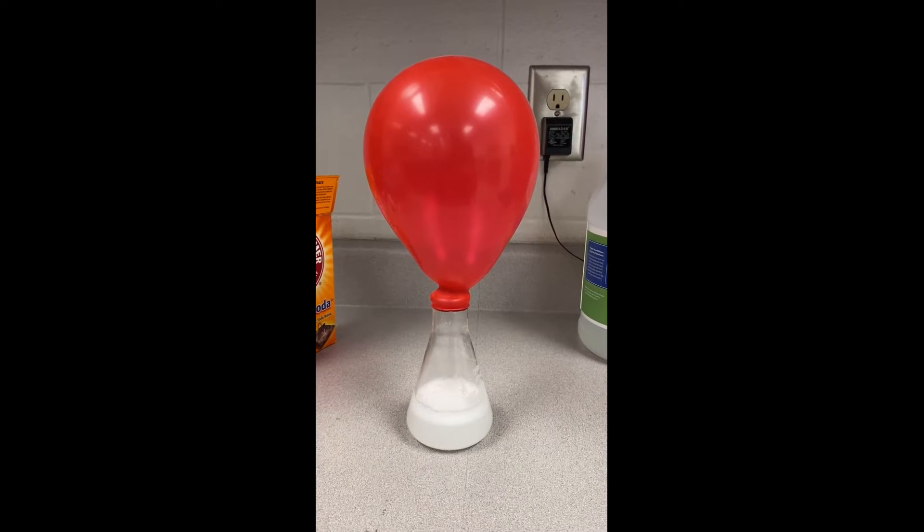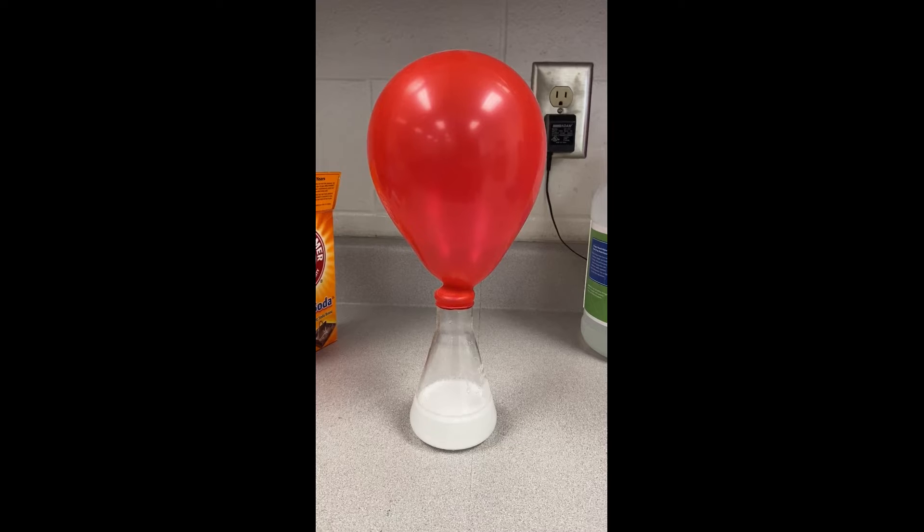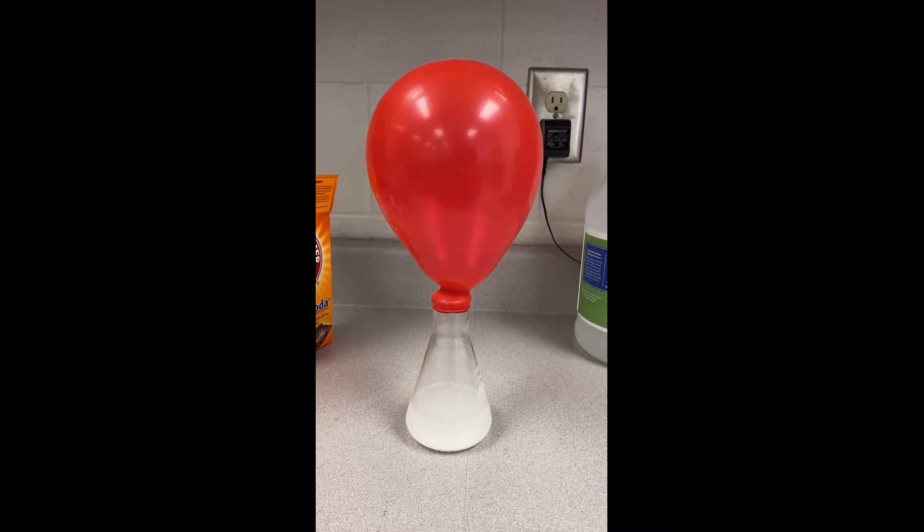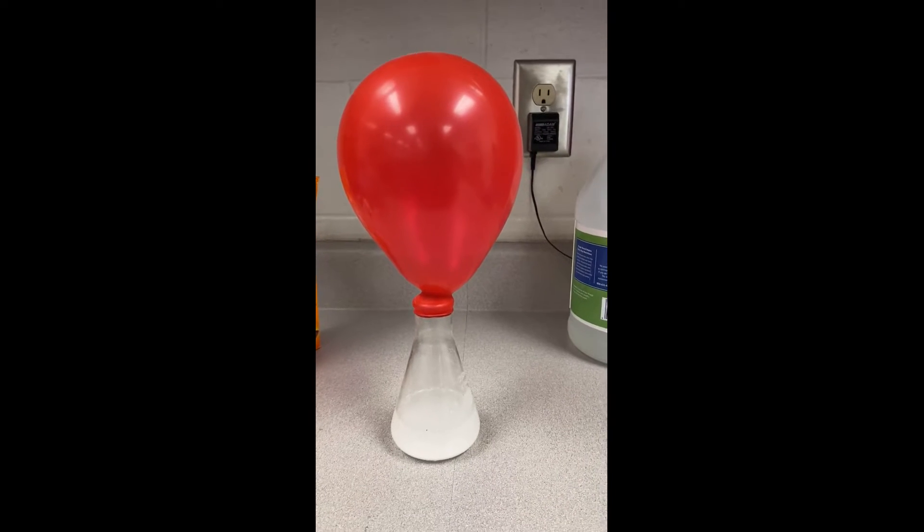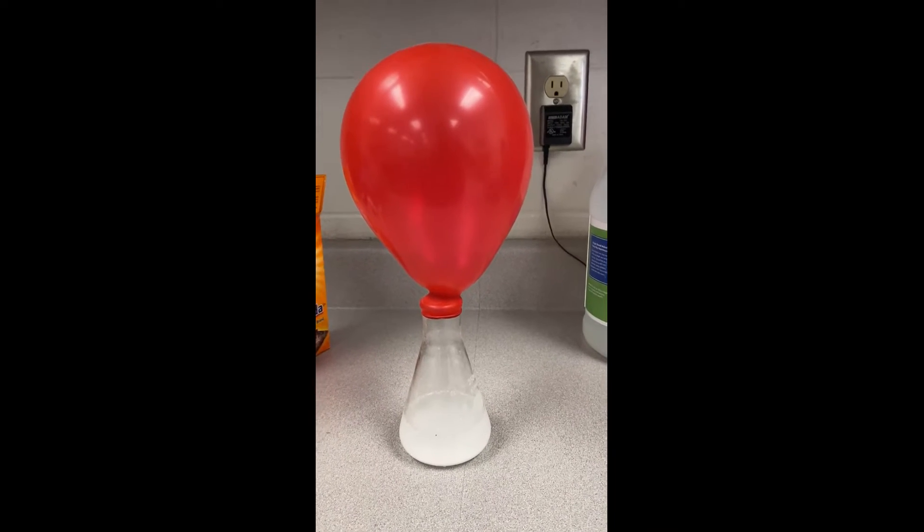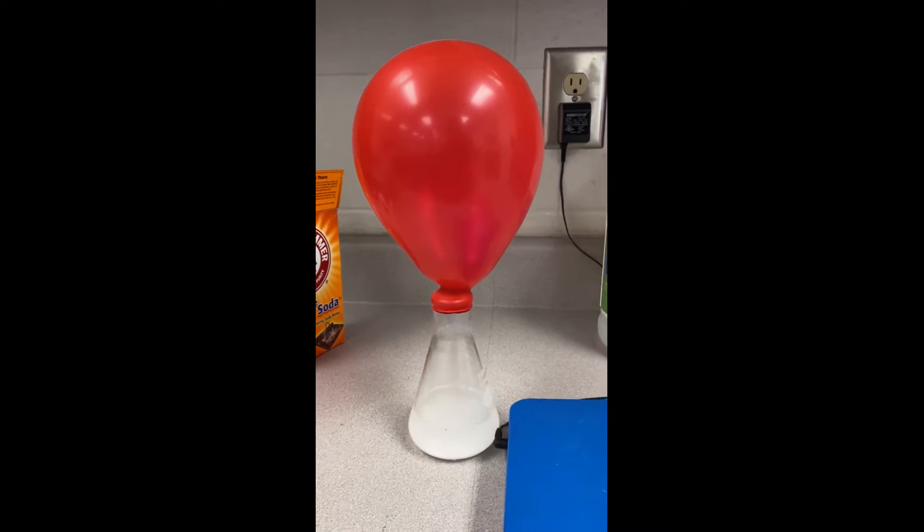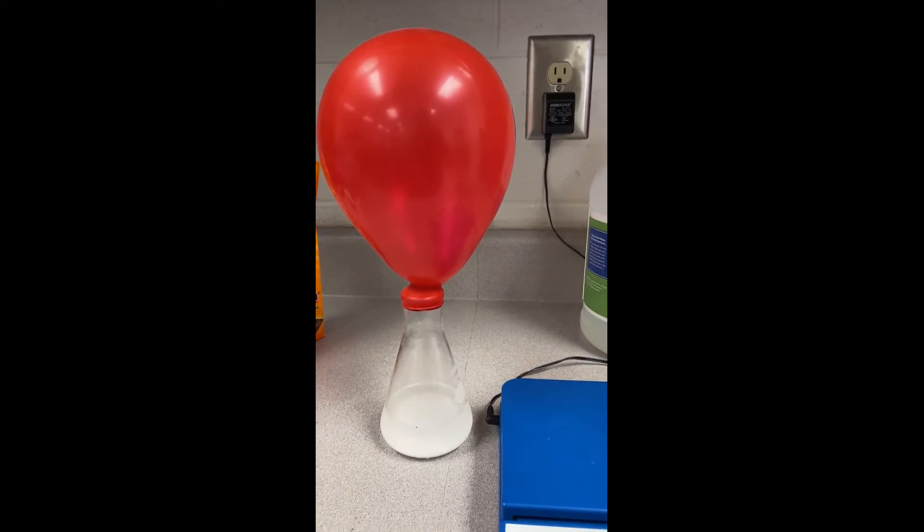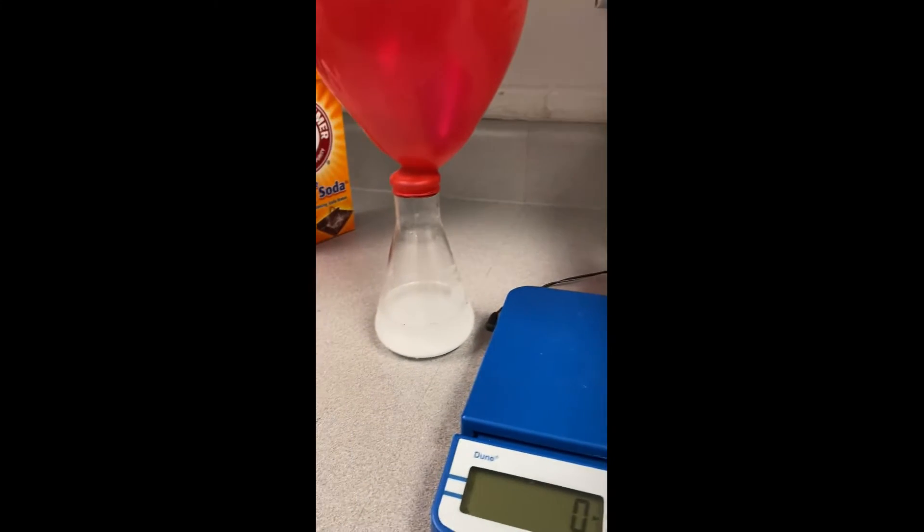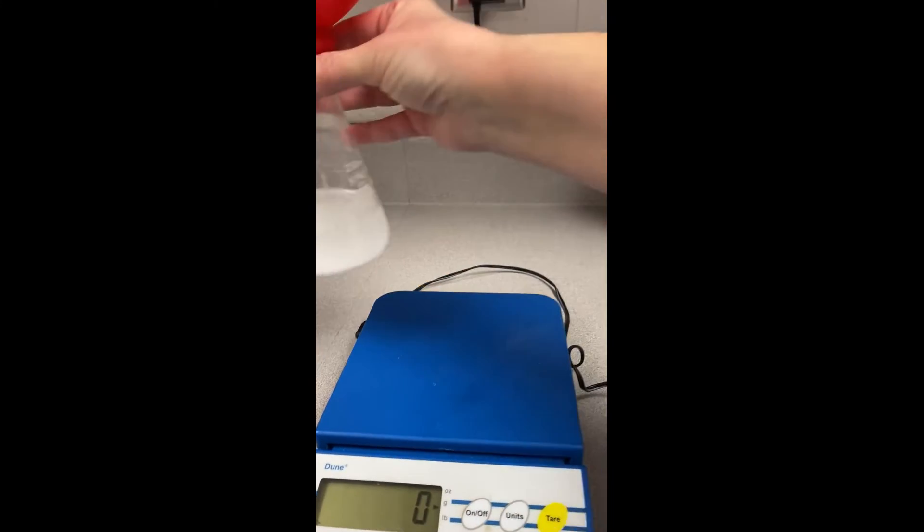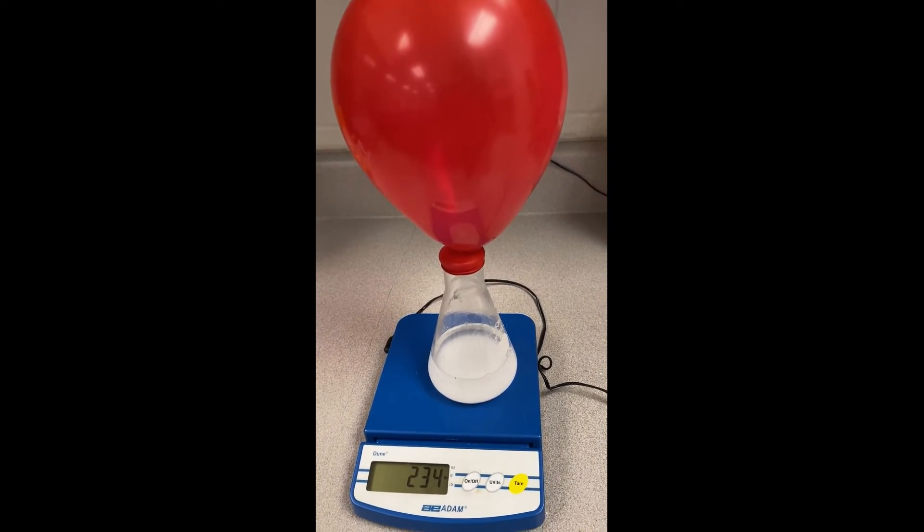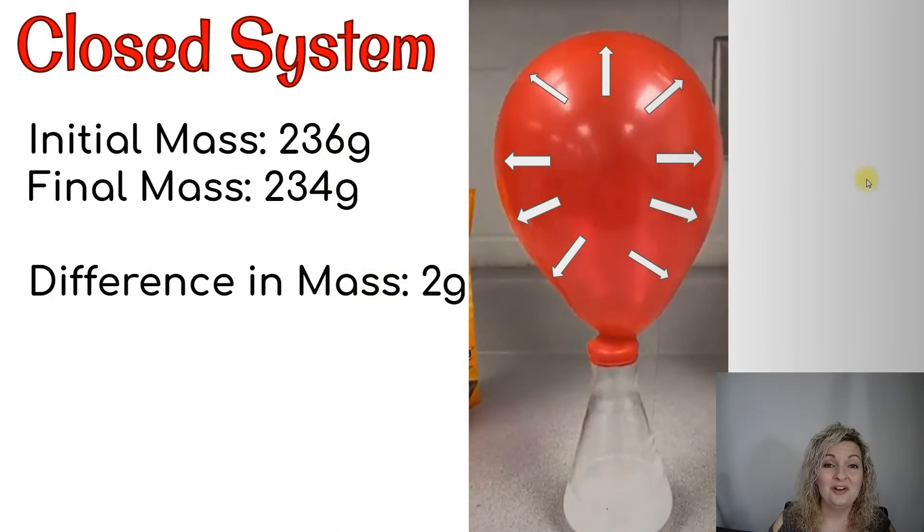Now when our chemical reaction is done and the bubbling has ended, I am going to go ahead and put it on a digital scale and take the mass that is going to be our final mass for our closed system. So remember the initial was 236. If the law of conservation is true in this case, we should get 236 as well. Let's see what we get. I'm going to put it on the scale and it is 234 grams.